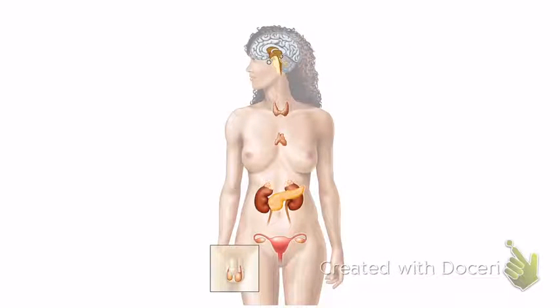Okay, and I provided a blank picture for you, and like I said, these are the pictures I will use. I provided a blank picture just so that we could practice. So let's try this. See if you know that one.